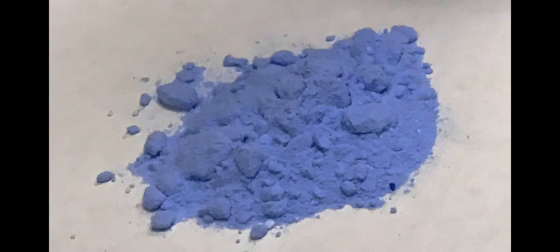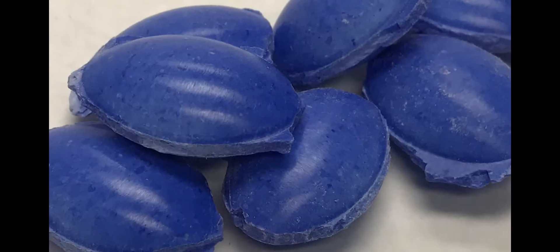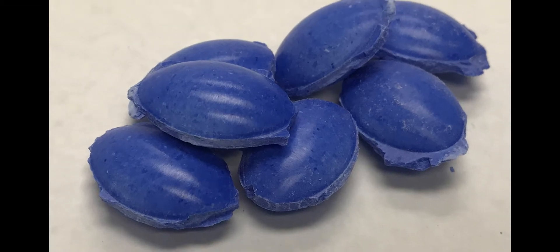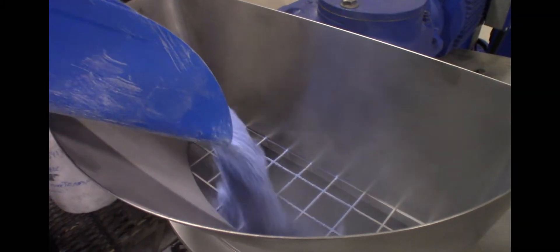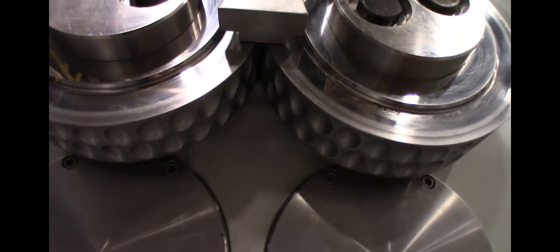In this demonstration, the material will start as a blend of powder and go through three phases, ending with clean, uniform briquettes. Material is fed into the compactor, which is equipped with 30 mm almond-shaped briquette rolls.